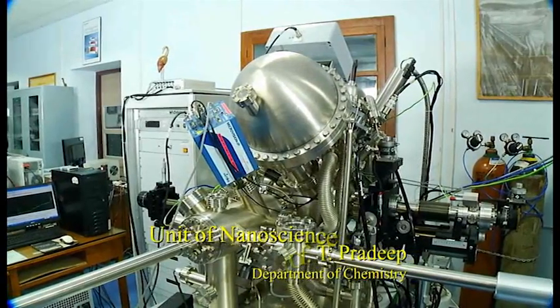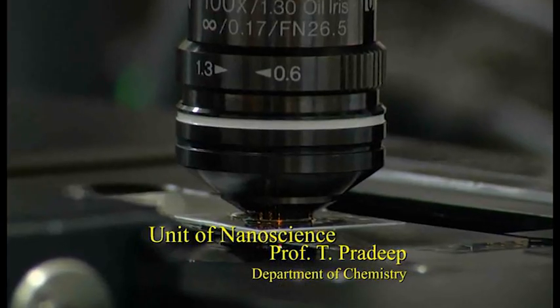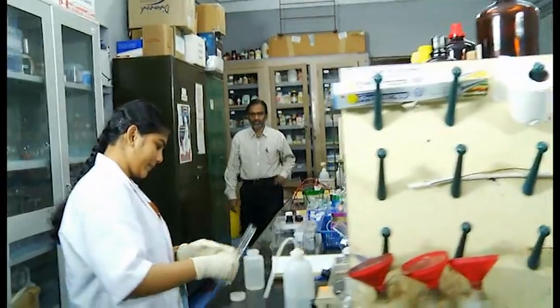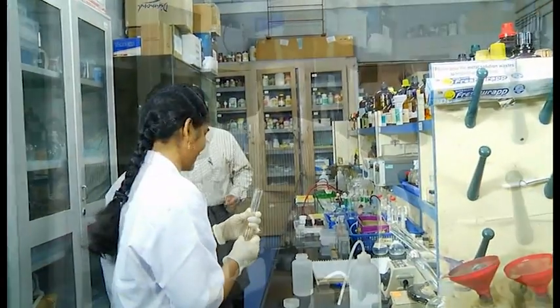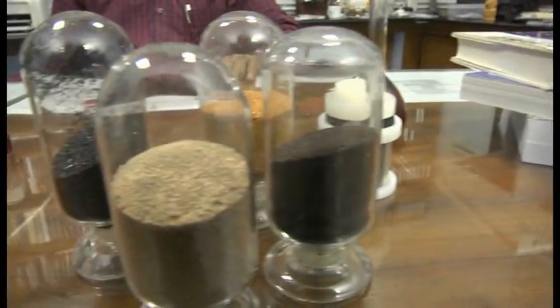Our laboratories principally focus on nanoscale materials. This lab of Professor T. Pradeep focuses on nanoscale materials.